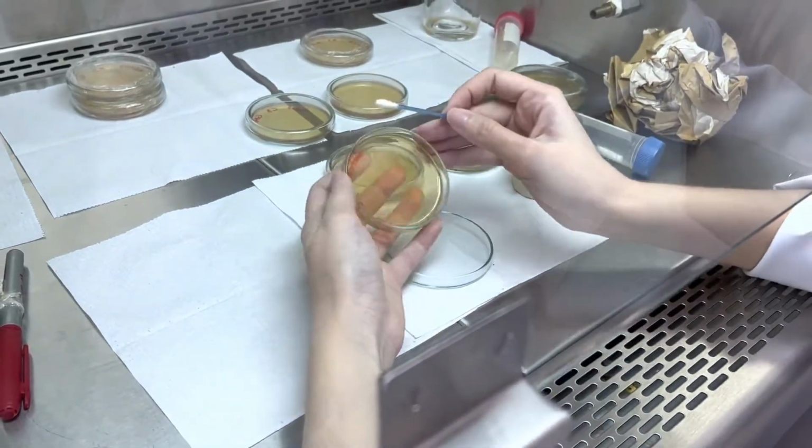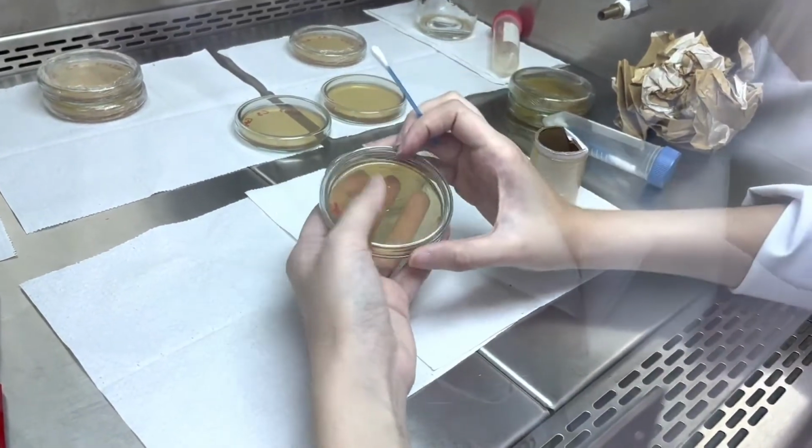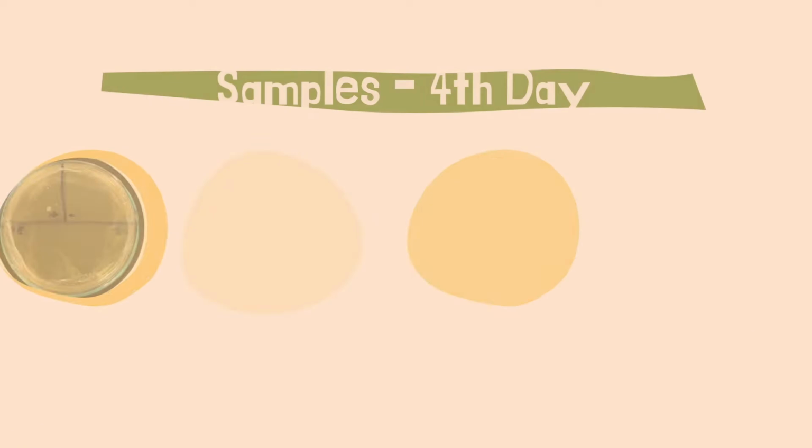All the experiments were carried out in laminar flow hood. After the petri dishes were swabbed with the samples, they were stored in the lab stove at 37 degrees Celsius for 4 days. After these 4 days have passed, we got the results.